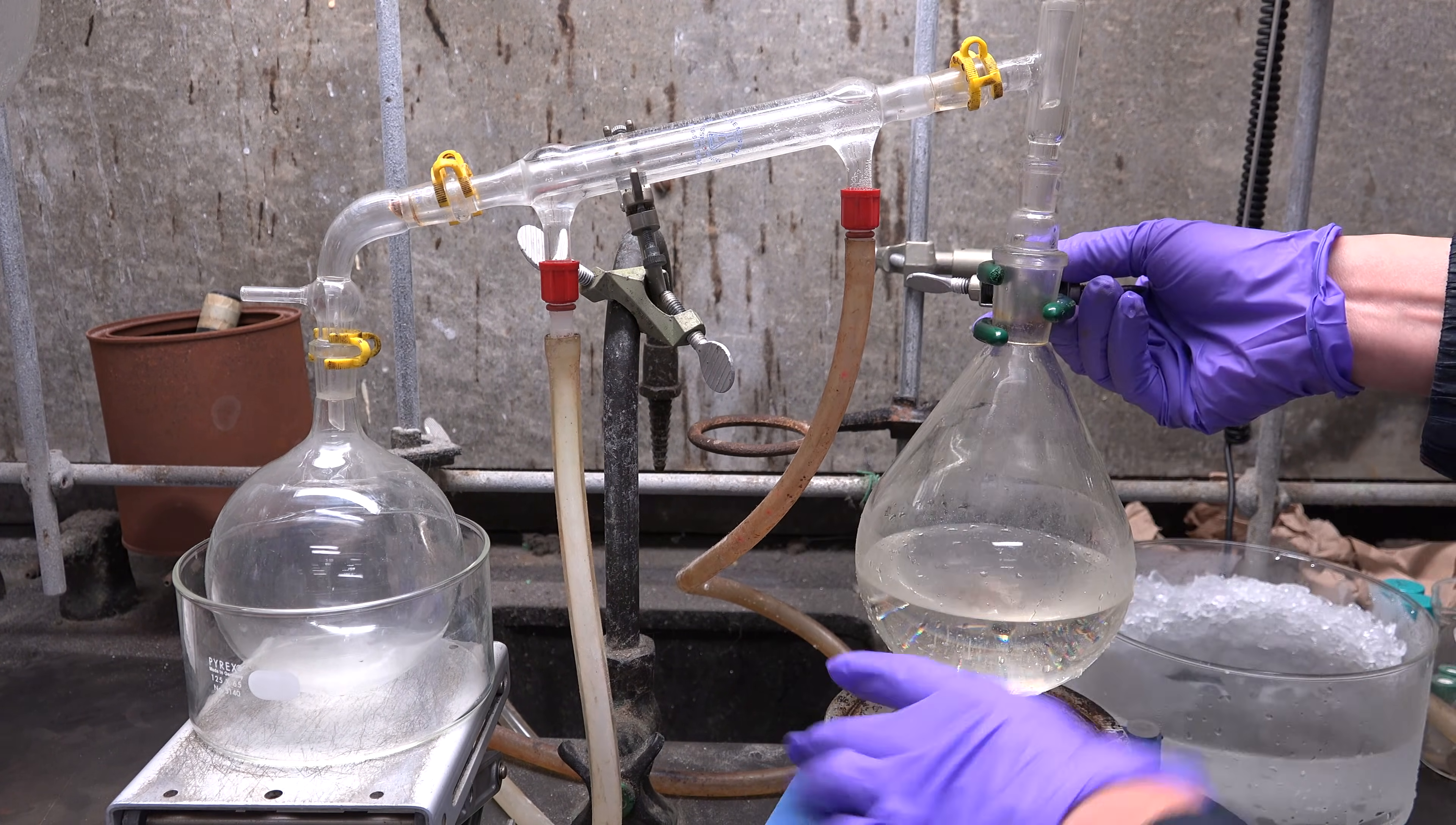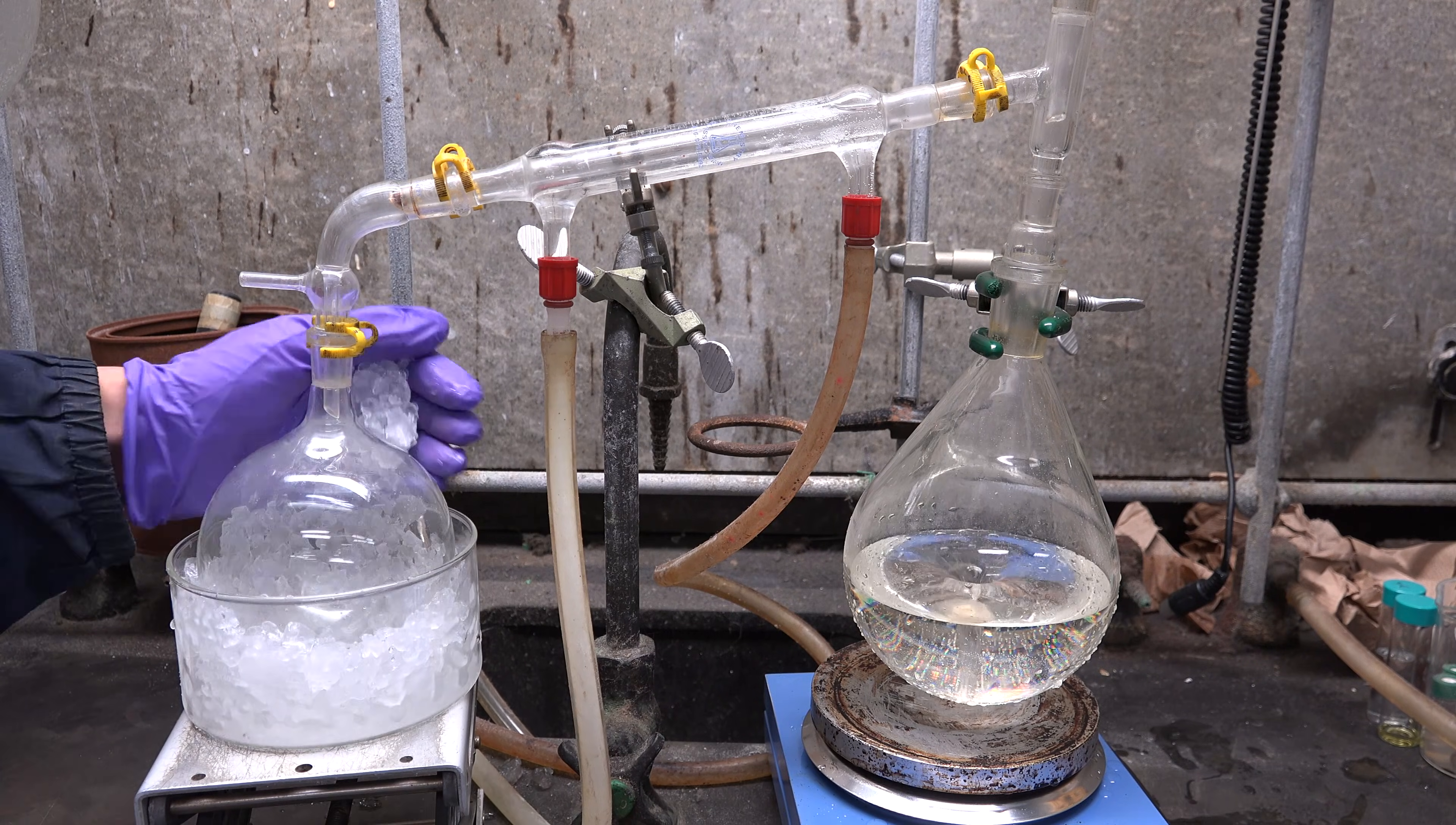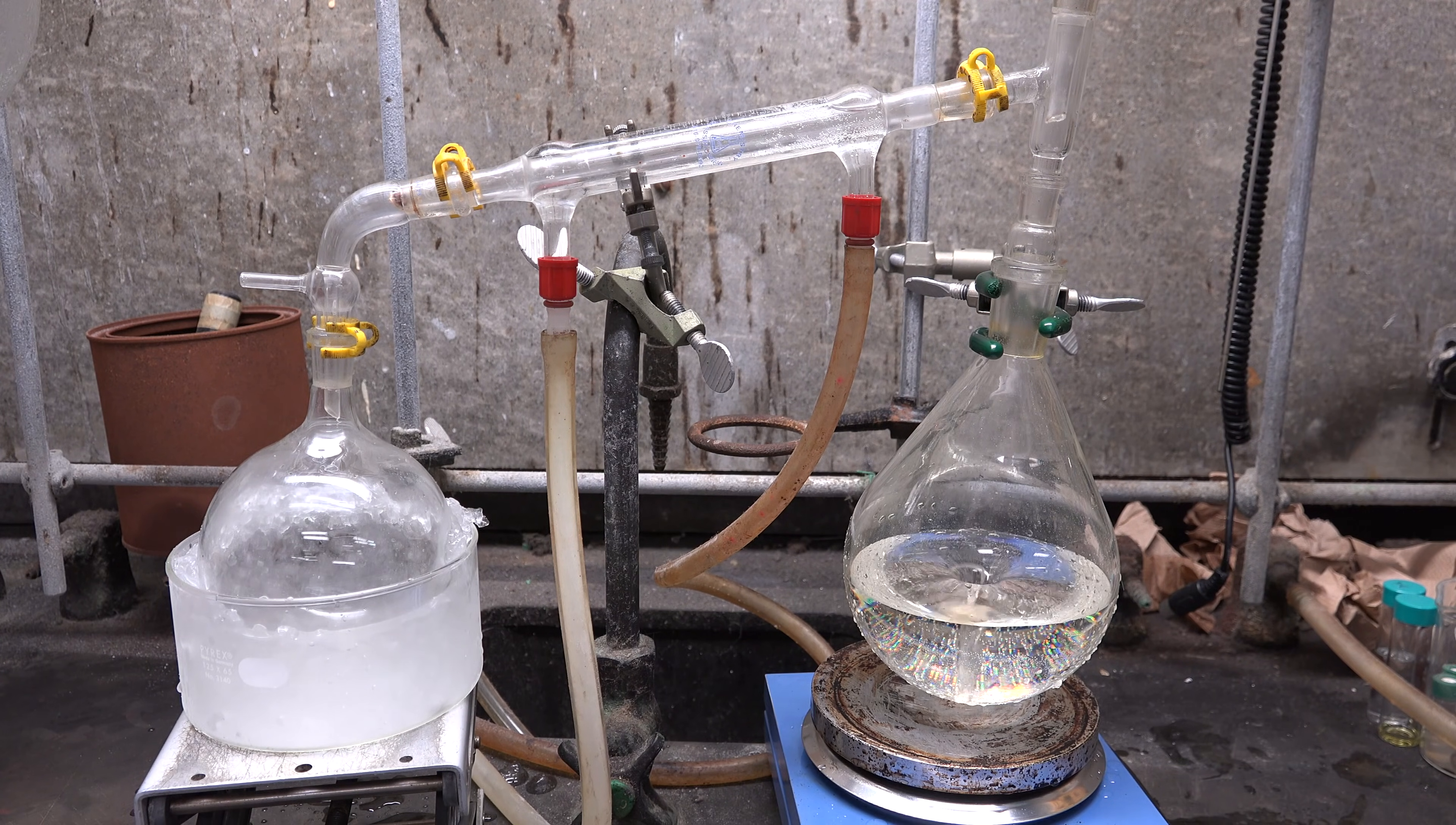Now we remove the ice water bath and pack our receiver flask in ice water. Looking back now this step was totally redundant. We just need to pack the receiver in ice water but the boiling flask can remain as is since we'll be heating it up later.